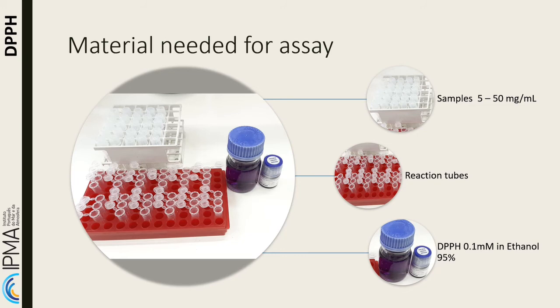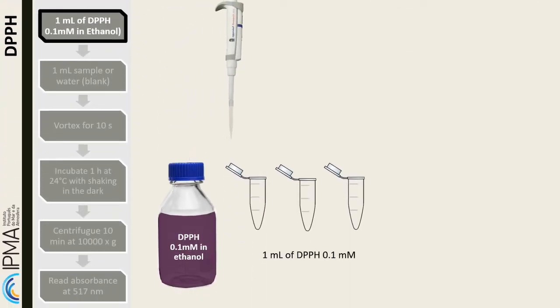To Eppendorf tubes, measure 1 milliliter of DPPH solution in ethanol and add 1 milliliter of sample, or water for blank. The samples must be tested in various concentrations and in triplicates.